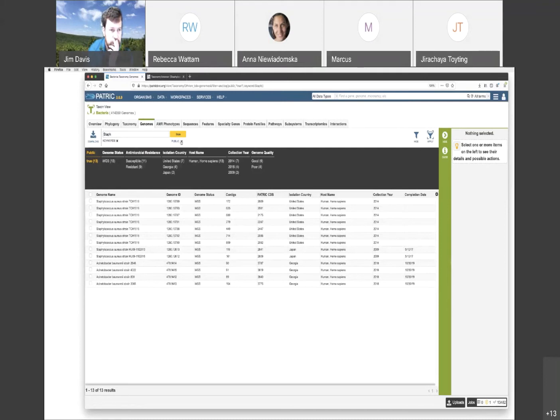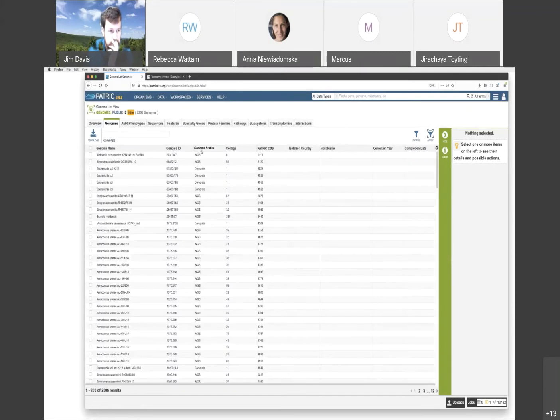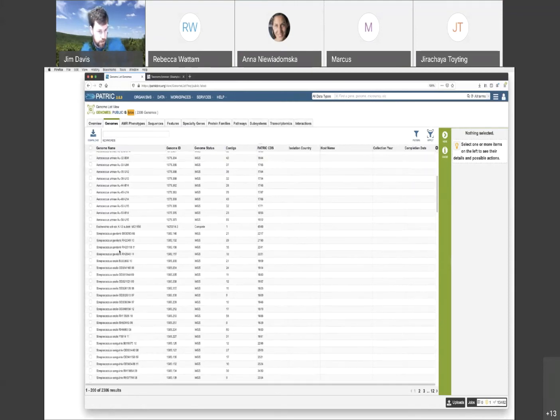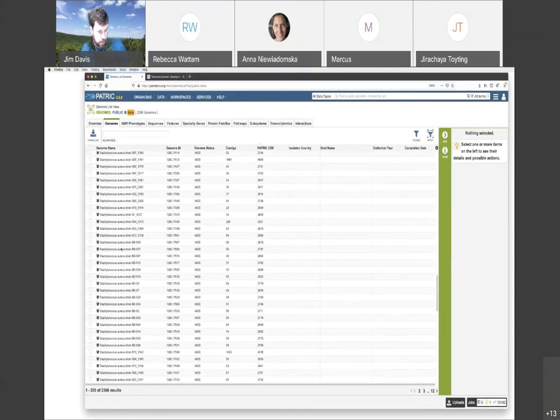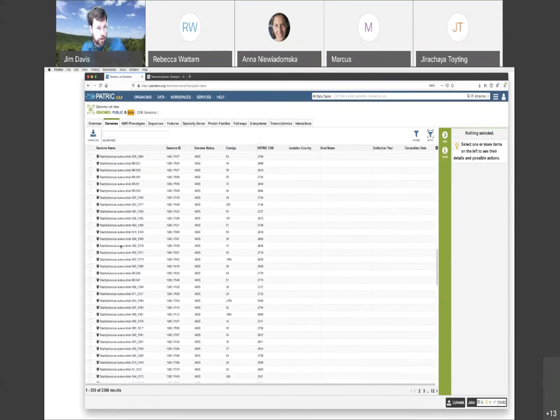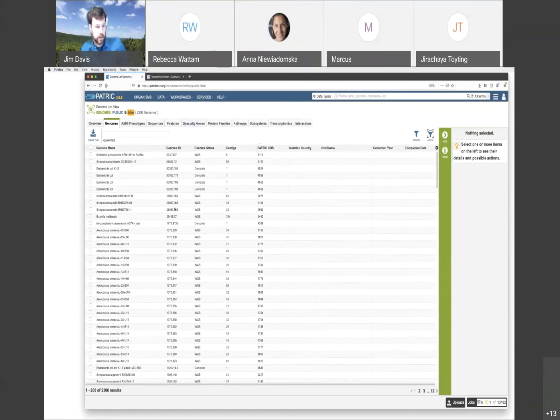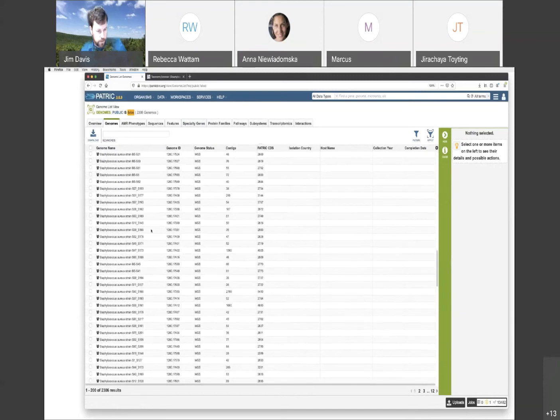Try going up to workspaces in my genomes. Yeah, my genomes. Look at that, Rebecca. And I should be able to find it in here. Hmm. Oh, those are groups. Well, that was a fail. Those aren't groups, those are shared, I believe. Oh, maybe that's why it was hard to see, because it's a public genome. I generated a public genome.